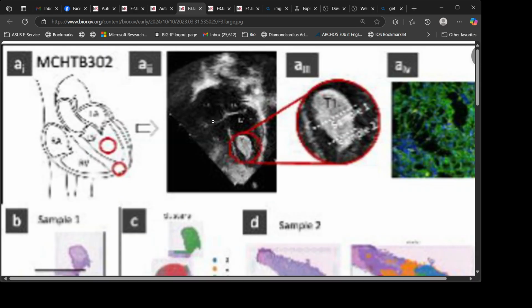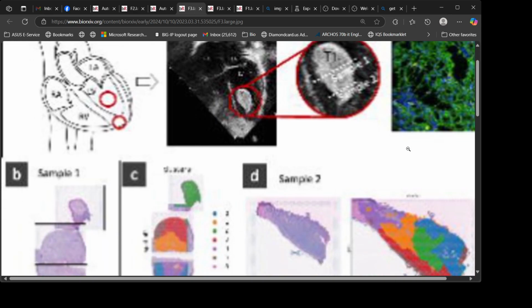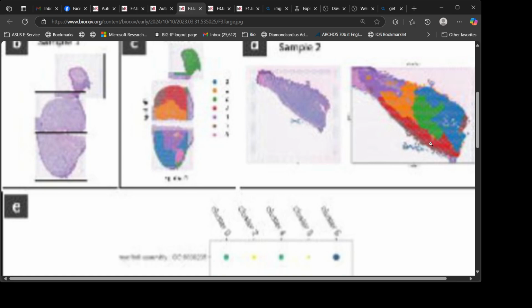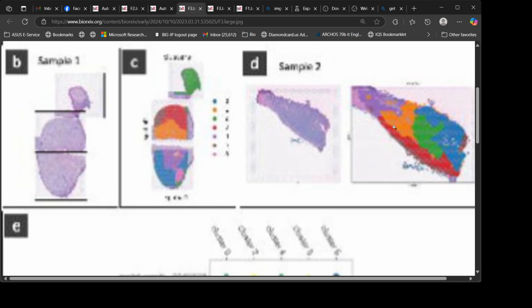Schematic representing approximate locations of sections taken for data generation using the 10x Genomics Visium platform. AV. Immunostaining with Ki67 indicating proliferation within the tumor, orange. Nuclei staining, Hoechst, blue, cardiac troponin T, CTNT, green. B. Reconstruction and concatenation within VR-Omics of 3 coplanar, H&E stained slices separated onto different Visium capture areas due to size of the tissue.